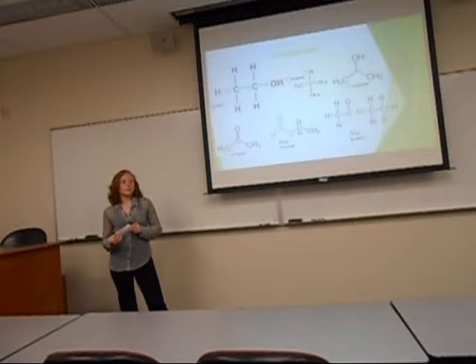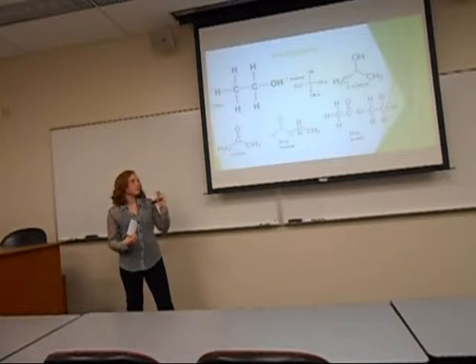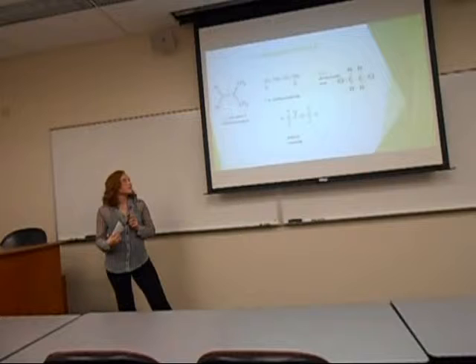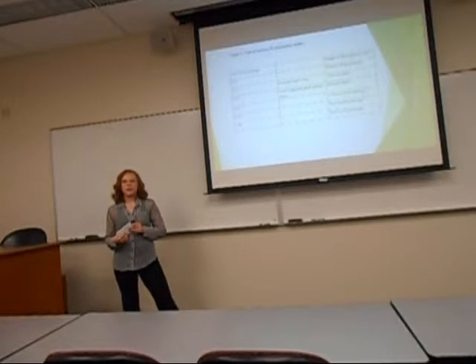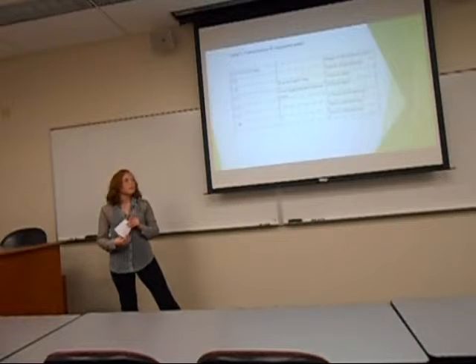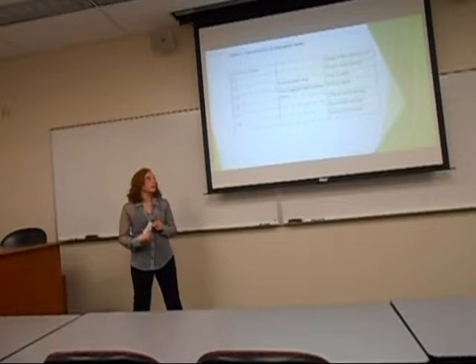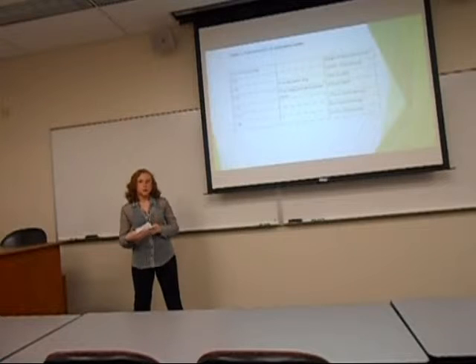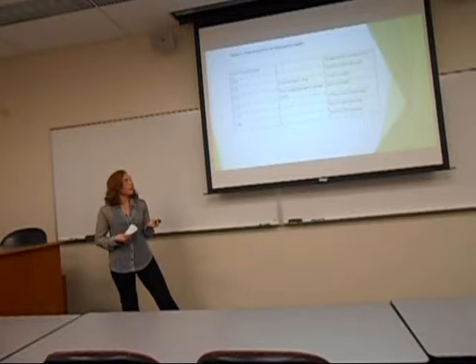These are some of the compounds that we decided to do research on. These are all their Lewis structures, so this is what you would use to find the IR spectra for each compound based on functional groups. And there's the rest of them, some of them. And this is the table used for NMR. So like your O to H is a 3500, 3100 range of absorption. So you would use the graph and base it on their peaks, and then you pretty much just base it on the ratio of areas, and then you would determine your unknowns that way.